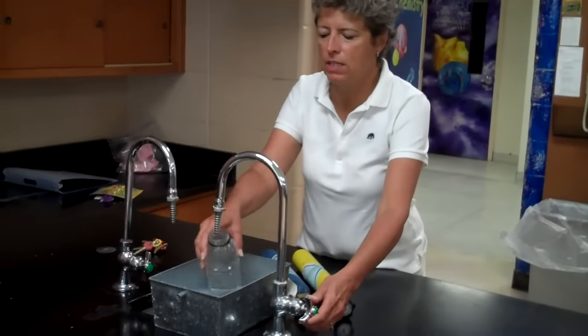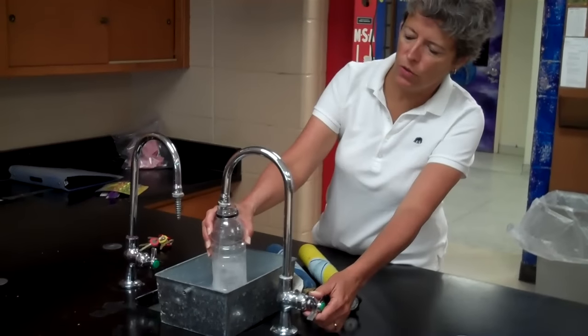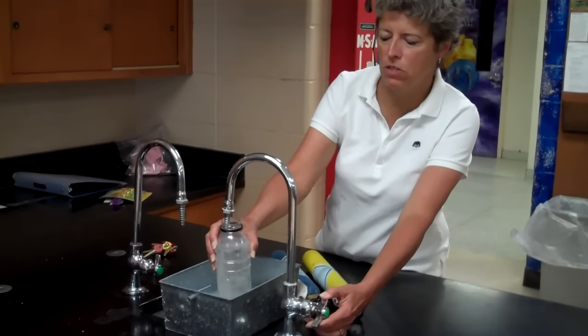The first thing we have to do is to get some hydrogen and oxygen into this bottle, and we're going to fill the bottle with water. It's called collecting the gas by water displacement.